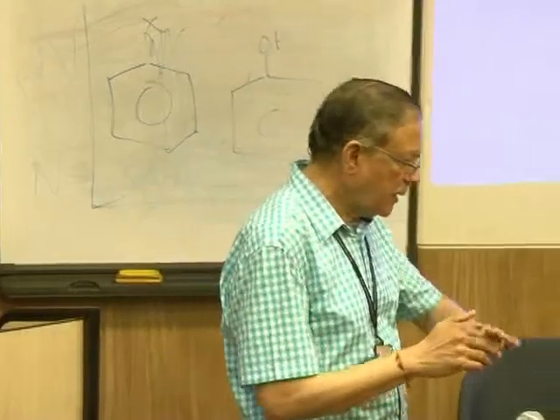Okay, what should be the nature of the stationary phase? If you remember, I had made a mention of coating of a suitable liquid on the surface of an inert solid support. Now we will talk today of what is that suitable liquid phase, especially in gas chromatography.